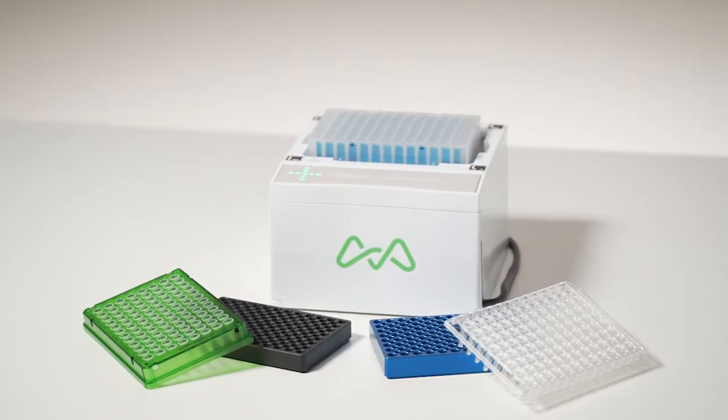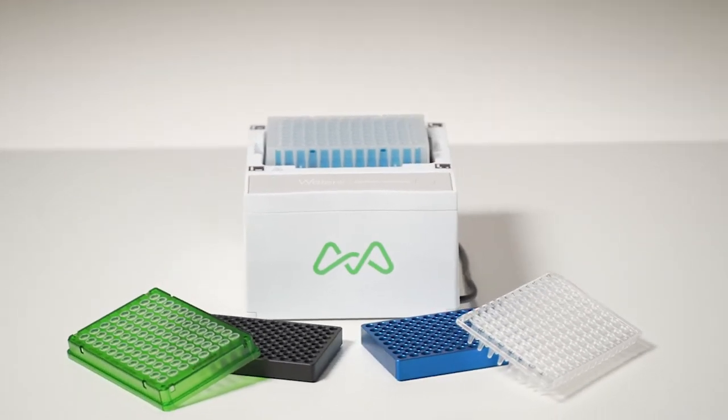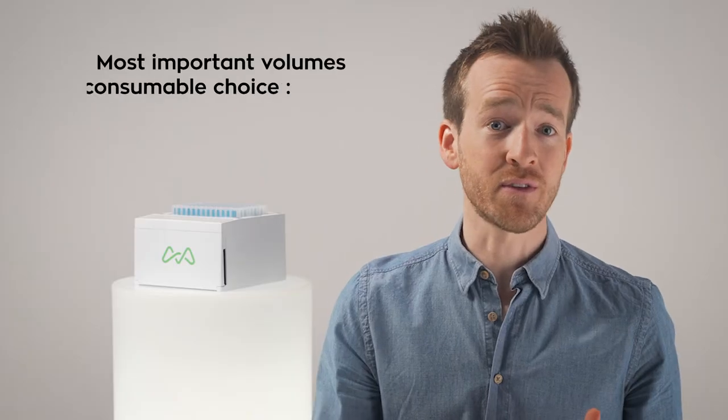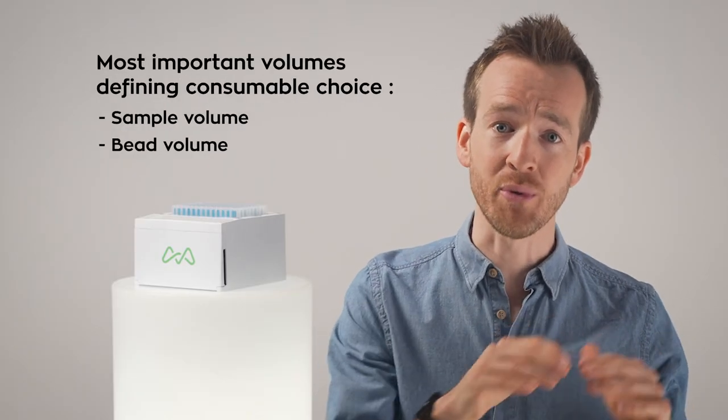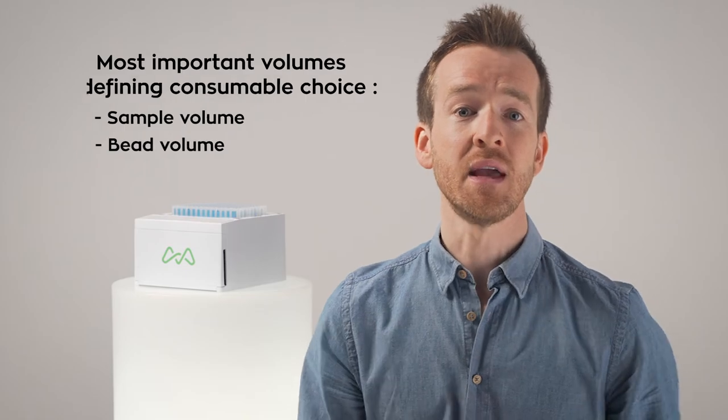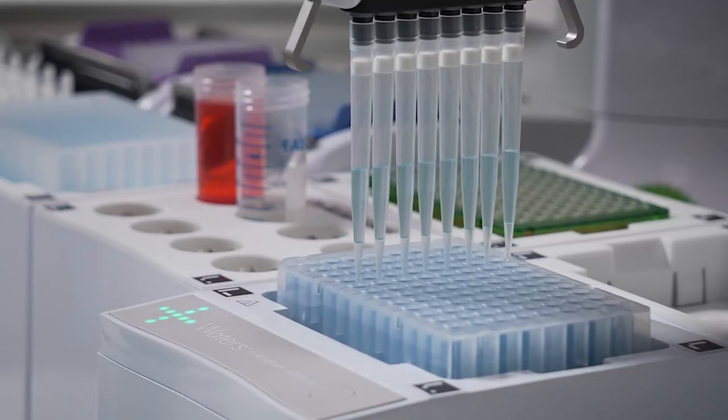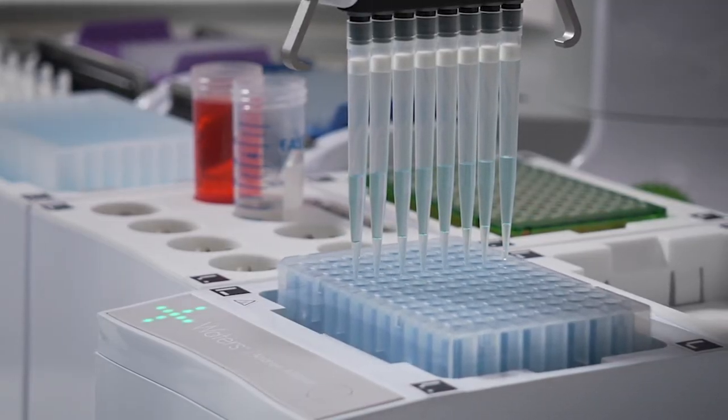With that in mind, here's a quick tip to help you choose your Heater Shaker Plus compatible consumable. Rather than worrying about the total volume of wash buffers you may need and thus opting for a larger volume plate, it's best to simply base your decision on the total sampling bead volume of your method instead. Those washing steps can easily be multiplied without requiring a larger volume consumable.